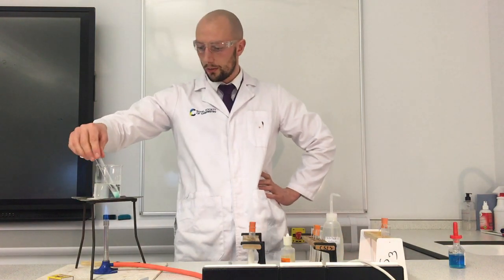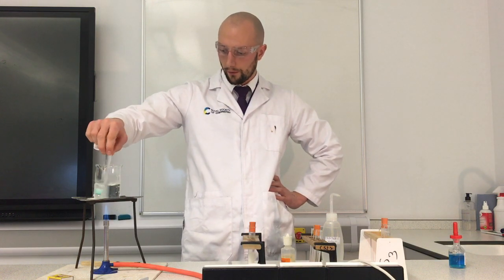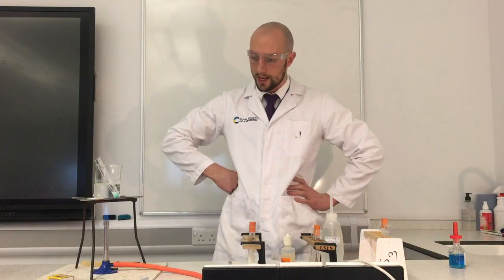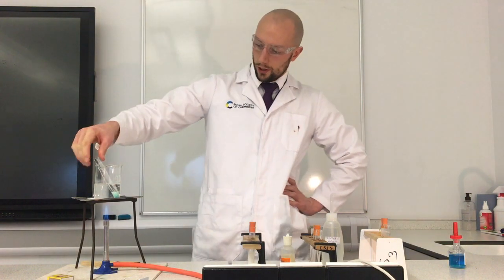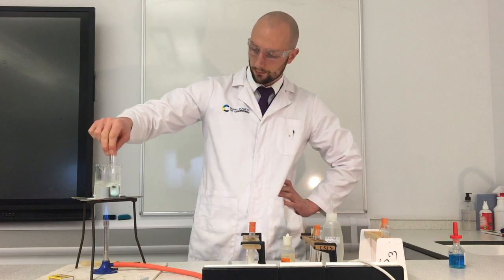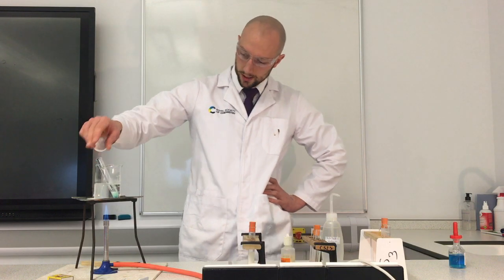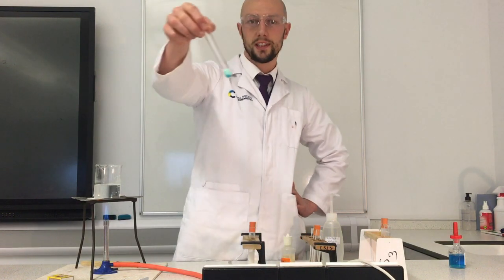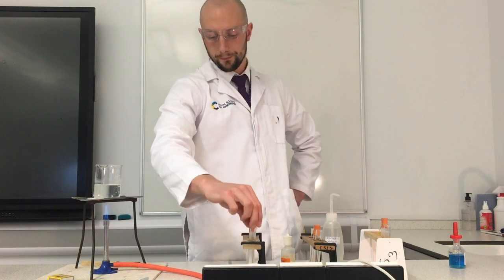Alright, let's give it some time. The water's hot, I can see the water's starting to boil. So the water's very, very hot. But is our Benedict solution going to turn red and tell us that there's glucose in it? No colour change yet. Still no colour change. Come on, colour, change for us. You're not going to? I don't think the colour's changing. Look at that. Definitely still blue. So there must be no glucose in the oil.